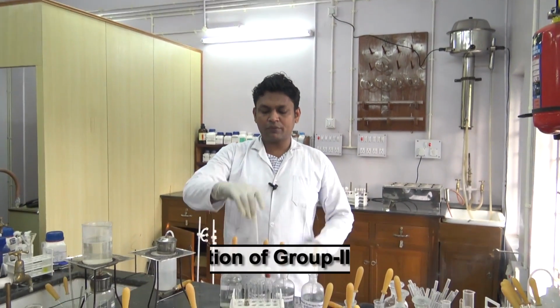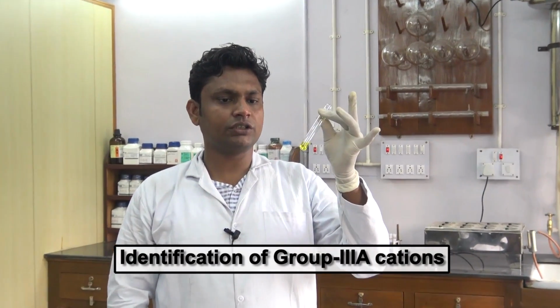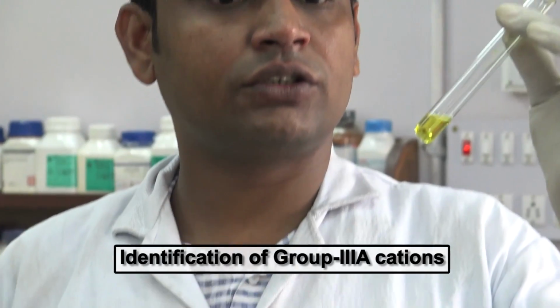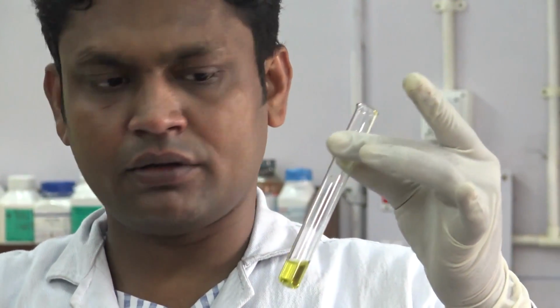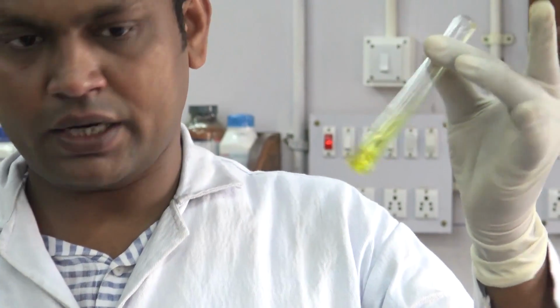Now we have to test for the group 3A cations. For this we have to take the sample solution, add a pinch of ammonium chloride into it and dissolve it.